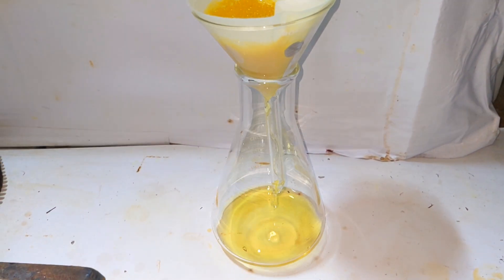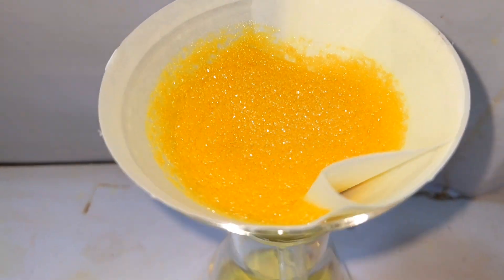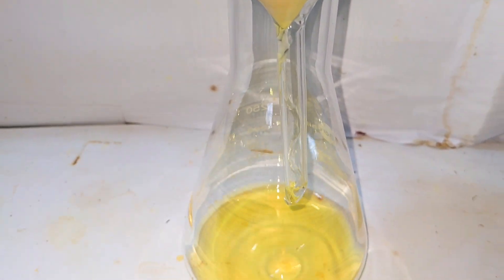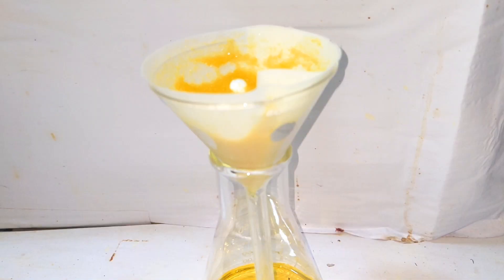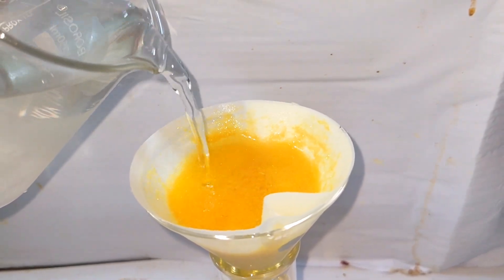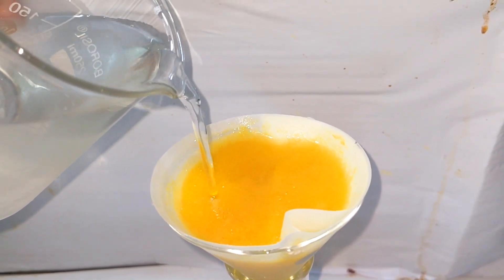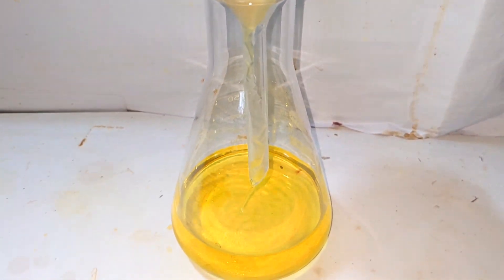Now we can filter out the solution. I am using a simple gravity filtration and that would be sufficient in this case. The filtrate which is a yellow colored solution can be discarded. The filtered product was then washed a couple of times with some ice cold distilled water and then it was allowed to dry.